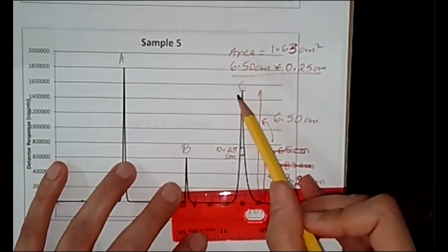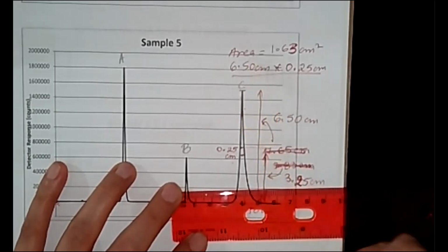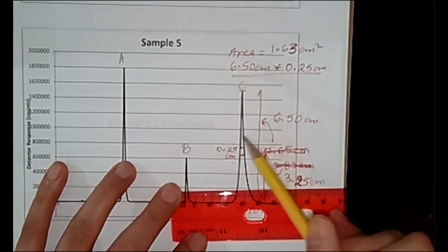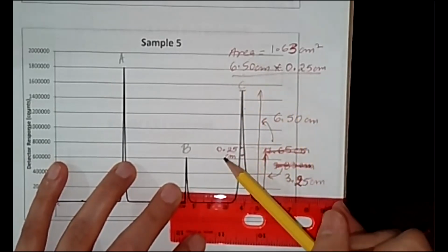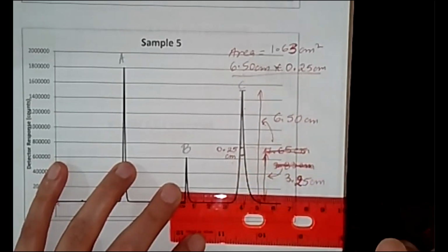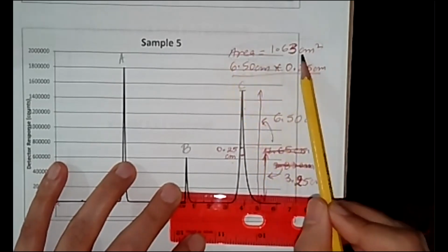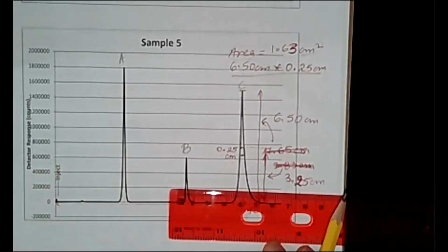To figure out the area under this peak C, I will multiply my height and the width at half the height to figure out the area in centimeters square for this particular peak.